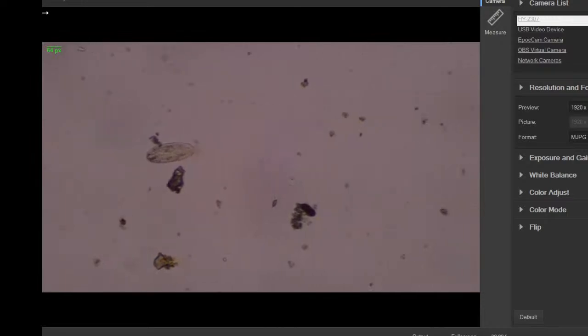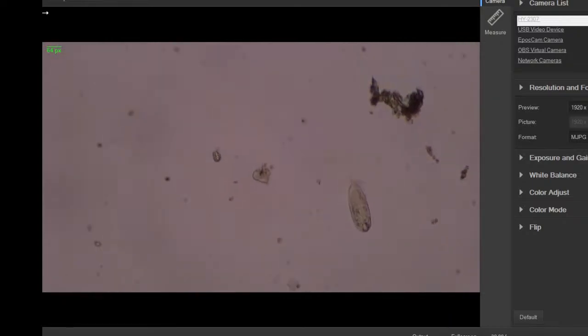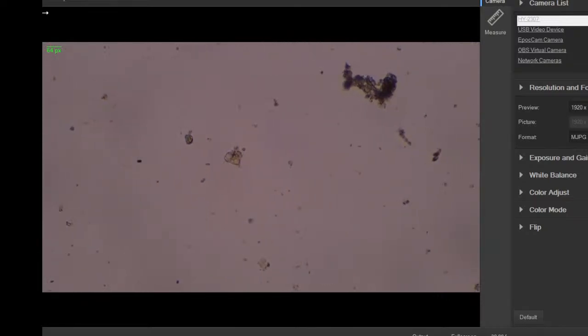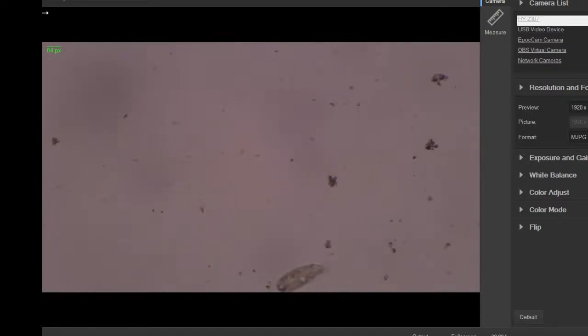And the top and bottom have these little spiky bits where the cilia fuse to form these structures called cirri, C-I-R-R-I. Kind of like thick hairs compared to the cilia, which are little tiny hair-like things. Anyway, they look spiky, kind of like a little crown on the top and bottom. It's very distinct in some of these animals. Stylonchia is one of them.